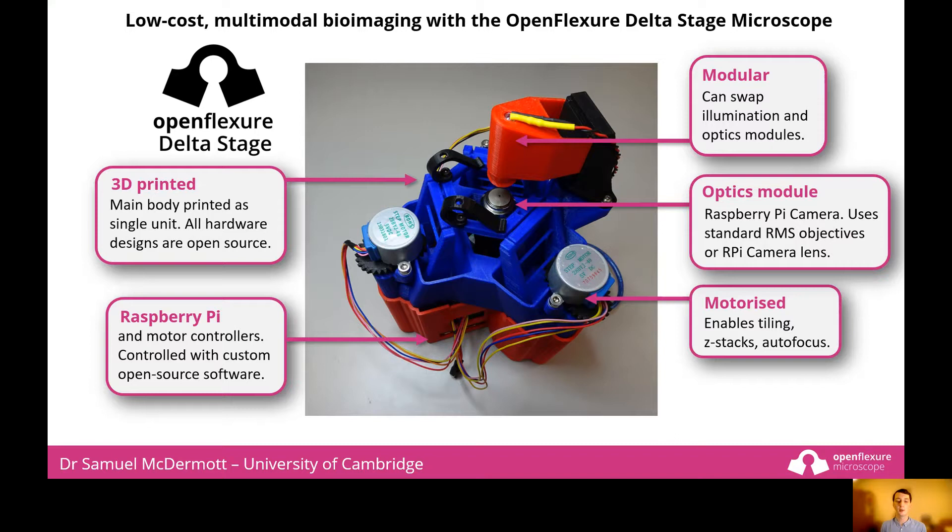The optics module uses a Raspberry Pi camera for imaging and can use standard RMS objective lenses, or even the lens that comes with the camera. The stage is motorised, meaning that complicated experiments using scanning and Z-stacks can be achieved. The microscope is controlled using a Raspberry Pi, and custom open source software has been developed with a friendly user interface.